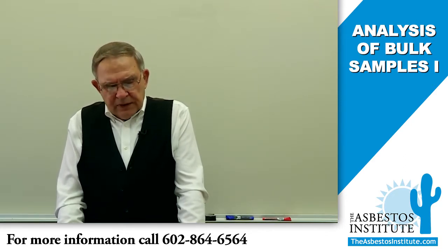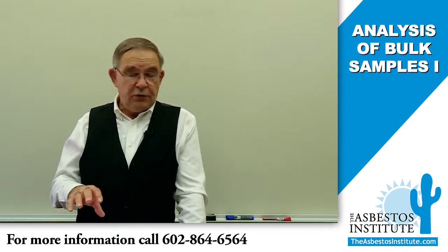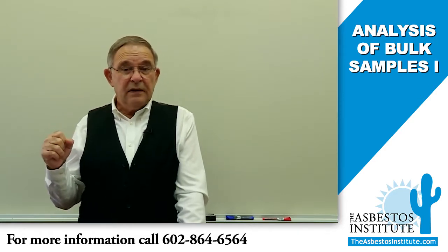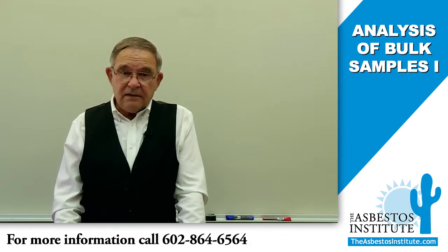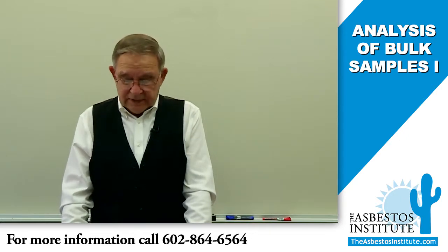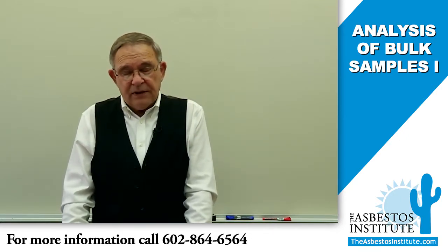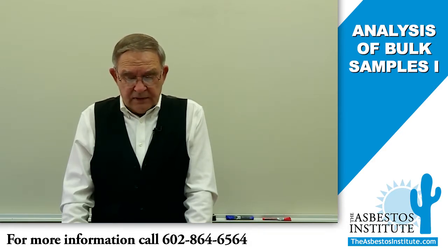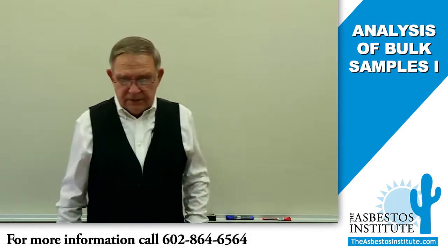in a way that was inexpensive, that would give us as much information as possible on whether there is asbestos present above a threshold amount, which is 1%, and if it is present, what type of asbestos it is. Is it chrysotile, amosite, an amphibole, what? It tells us how much is there. Mainly, we need to know this for the application of the regulations that have a threshold percentage. So the analysis is to give us the threshold percentage.